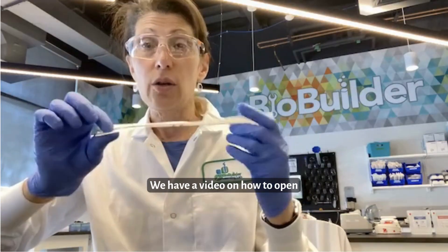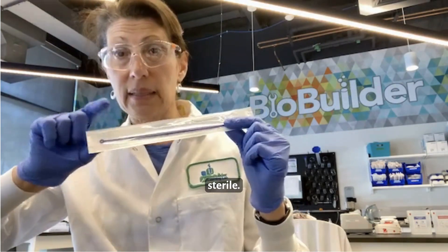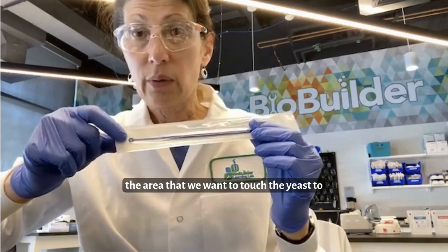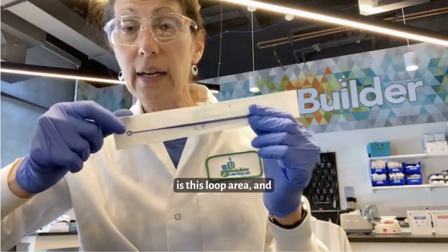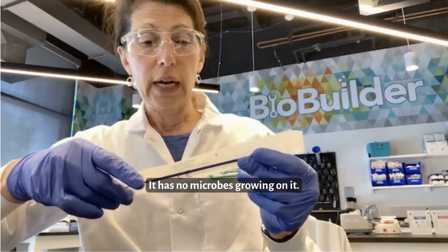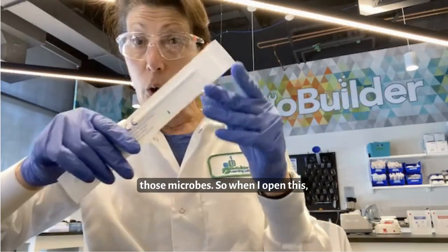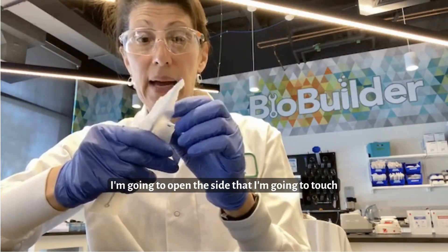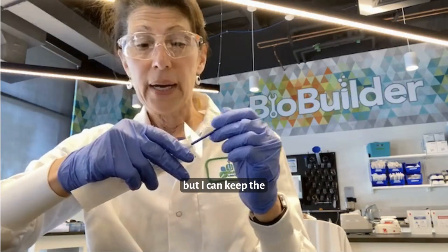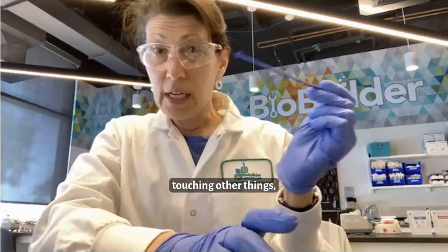We have a video on how to open loops and serological pipettes so that they remain sterile. As a quick review, the area we want to touch the yeast to is this loop area. Every piece of plastic, including this loop, is sterile — it has no microbes growing on it, having gone through a process to remove all microbes. So when I open this, I'm going to open the side that I'll touch with my gloved hand. Having touched it, it is no longer sterile, but I can keep the loop from touching other things.